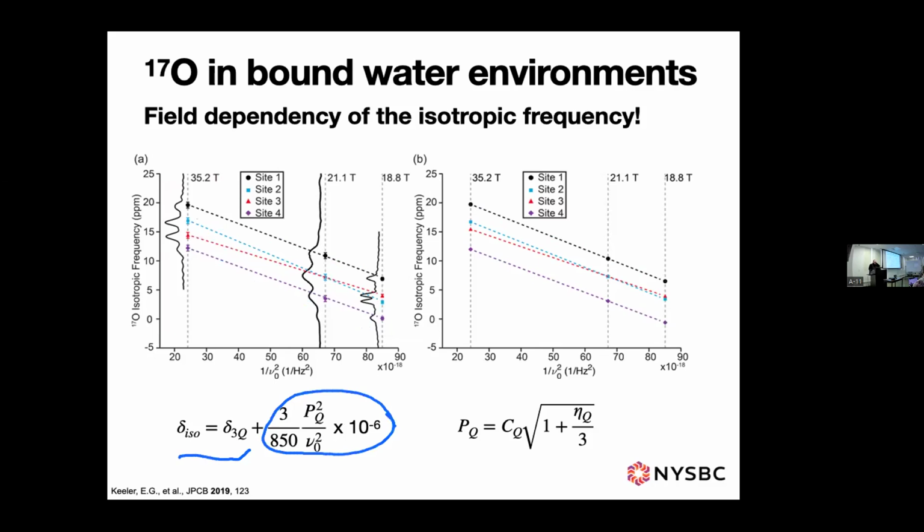But you can see that it was just hard luck on us that our first data point was right there. And it turned out that while we had access to an 800, the only probe that we could do experiments on was a 1.3 millimeter probe, and we just couldn't get good enough efficiencies on the MQMAS with the small amount of sample that we had to do an MQMAS experiment on that sample in that probe.